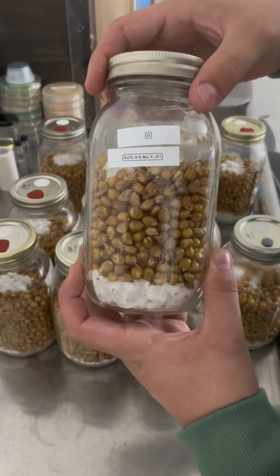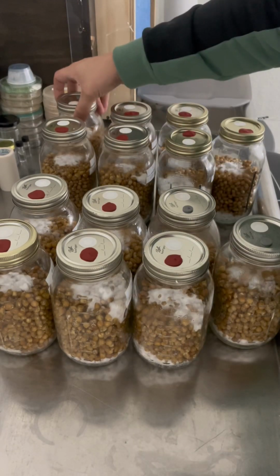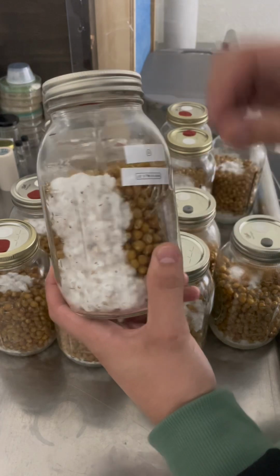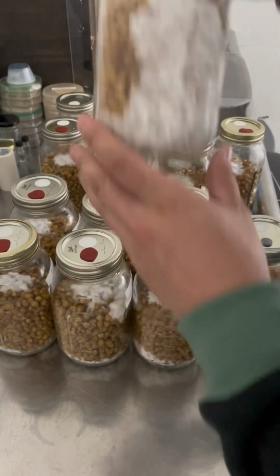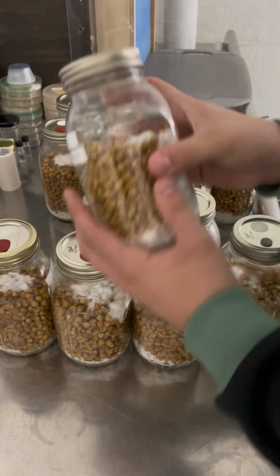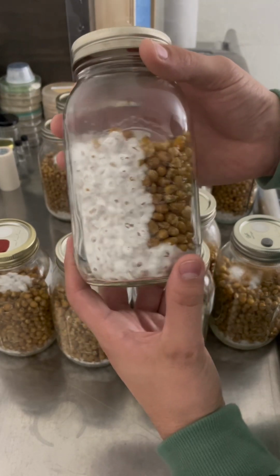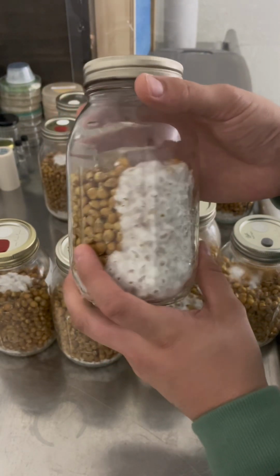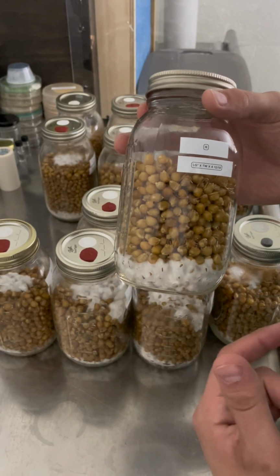But this is one of the drippy corn. You know, there's a bunch of growth in the middle, so it's hard to tell. I'll try and show you a couple from each that have been sprayed down the side. But this is a drippy corn where I hit it on the side. So there's a lot of growth on there. But here's a regular one also with it down the side. Let me find one. Here's a regular one where I hit it on the side also. And I used 5 cc's in all these, so the control should be pretty similar. But they look like they're growing pretty close to the same. But like I said, I'm gonna be doing a break and shake right now, and then we'll check back when they get a little closer.